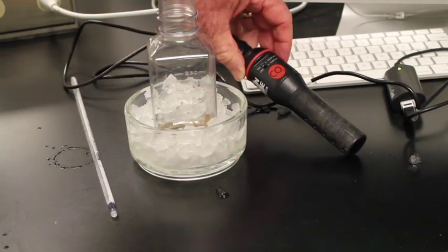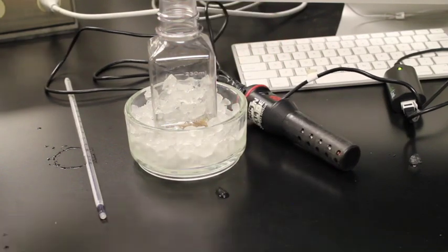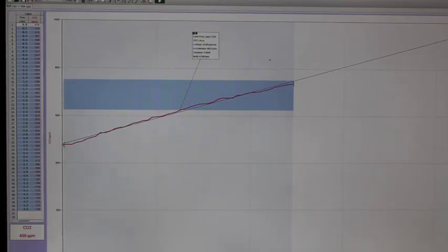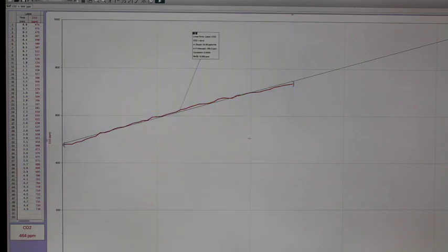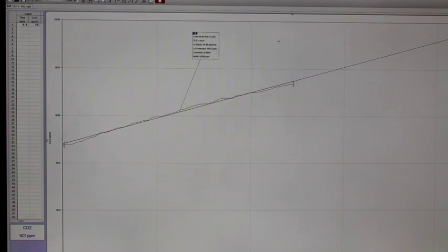Then in 5 minutes we'll add the CO2 probe to it, and we'll start it on the computer again. Okay, now we are ready to do our next trial. So I'll click that off. The crickets have been under here for 5 minutes, and so now they're nice and cool. So I'm going to go up here, collect, play, start. Now I'm going to store the latest run so we can see both of these together, and they'll both be on the same scale.